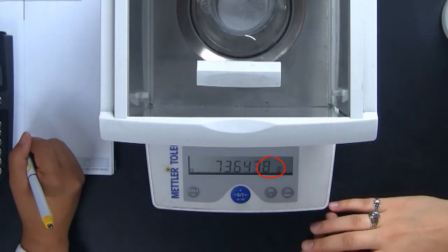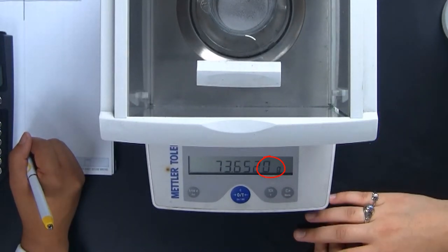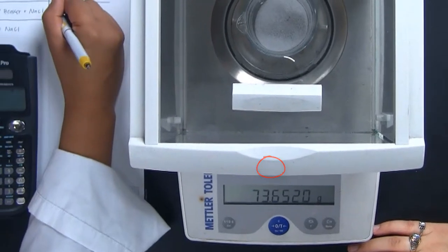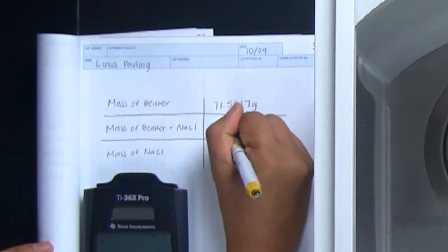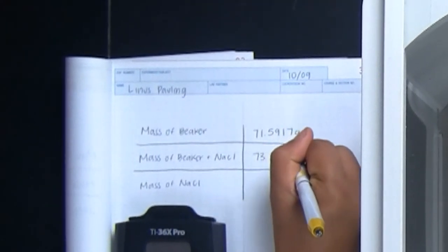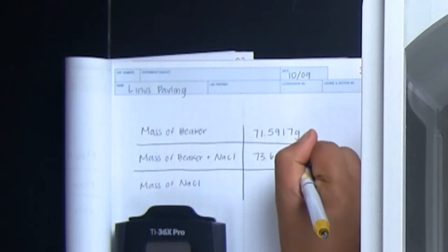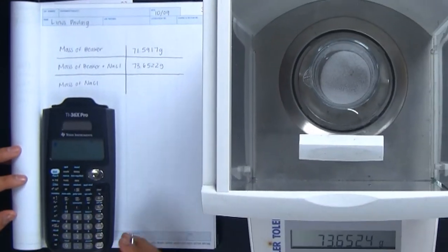She waits for a moment for the balance reading to settle down. Remember, the last digit is the uncertain digit. You may get some fluctuation in that digit, but that is normal. Choose the value that seems to be the most consistent.